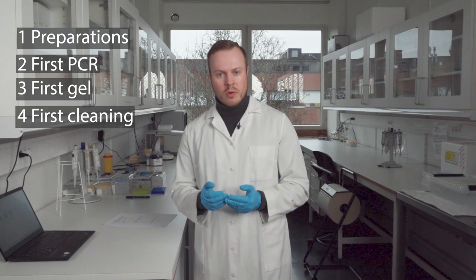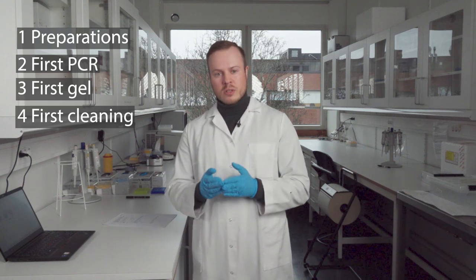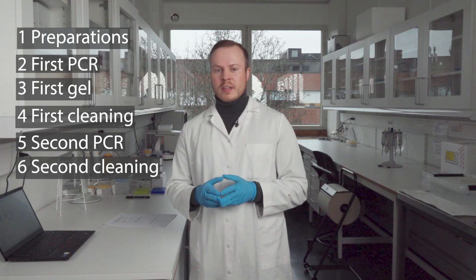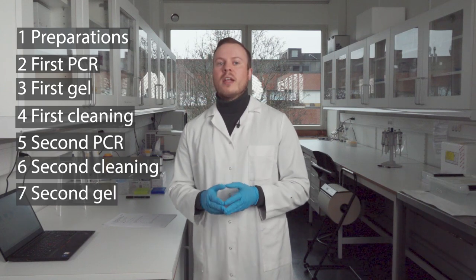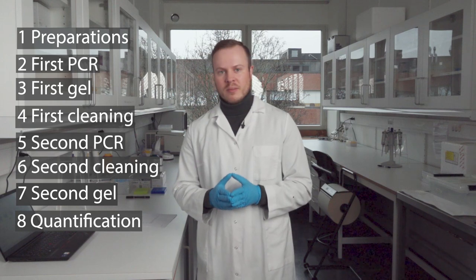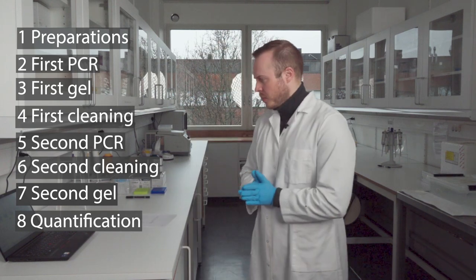The first step is the preparation step, which this episode will be about. The second step is doing the first PCR, then we will go through the first cleaning and the first gel. Then we have a second PCR, a second cleaning, a second gel, and lastly the quantification of the amount of DNA we get at the end.